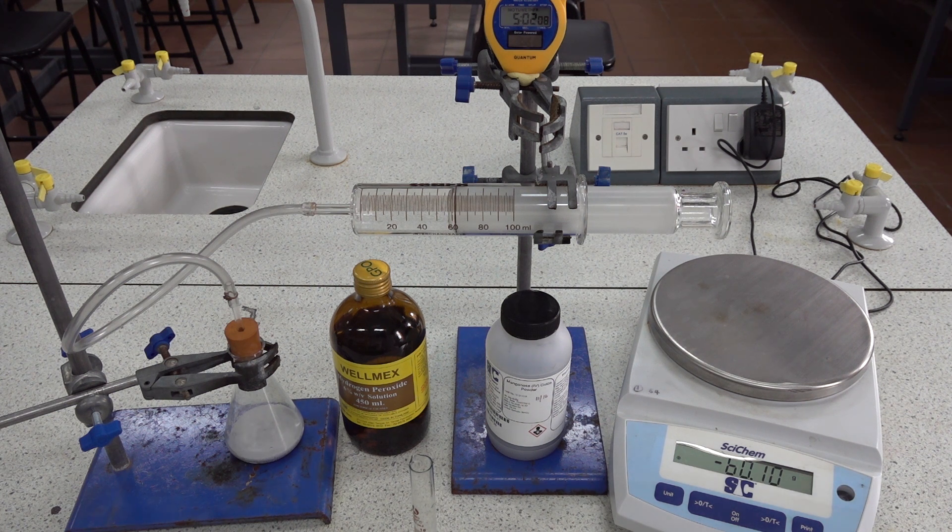We'll stop taking readings at about 5 minutes 30 seconds, assuming that it took about 30 seconds to start the reaction off. We will then be able to record results for 5 minutes.